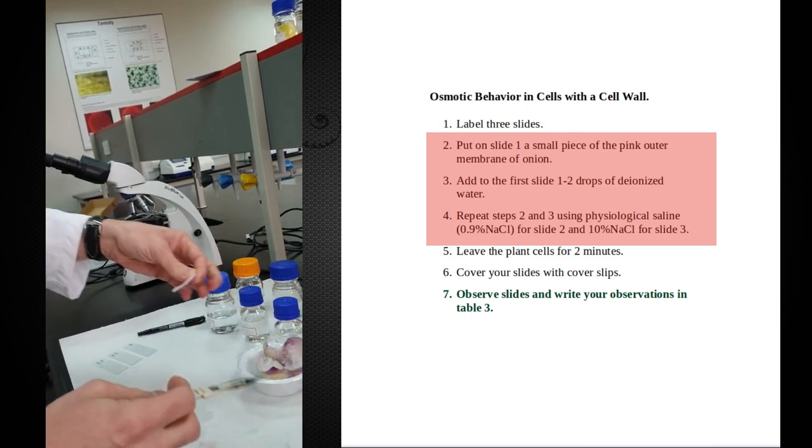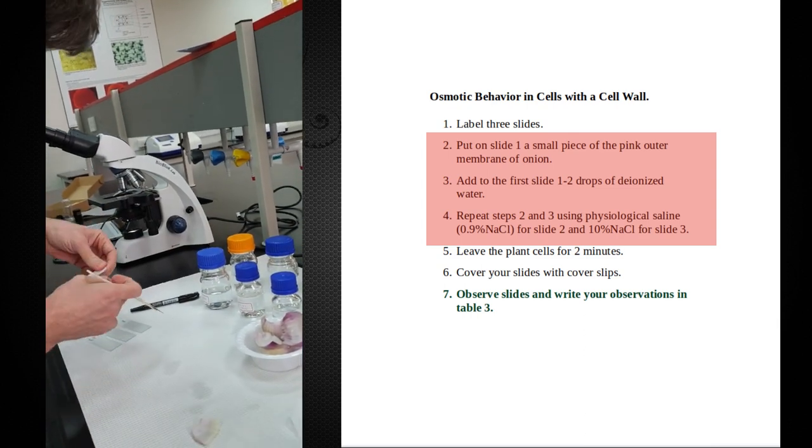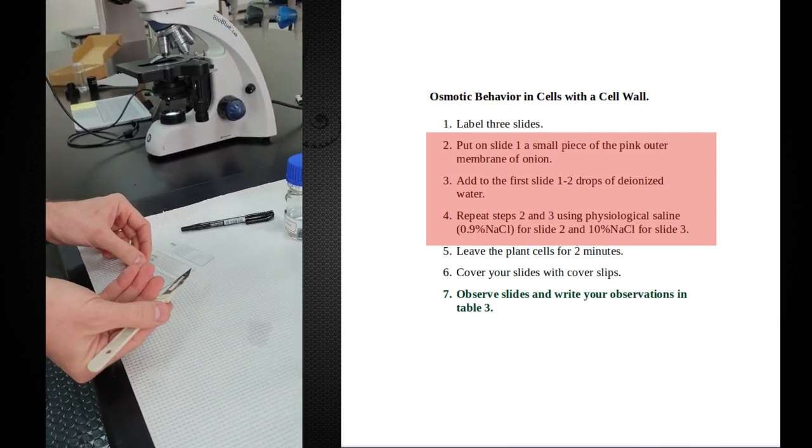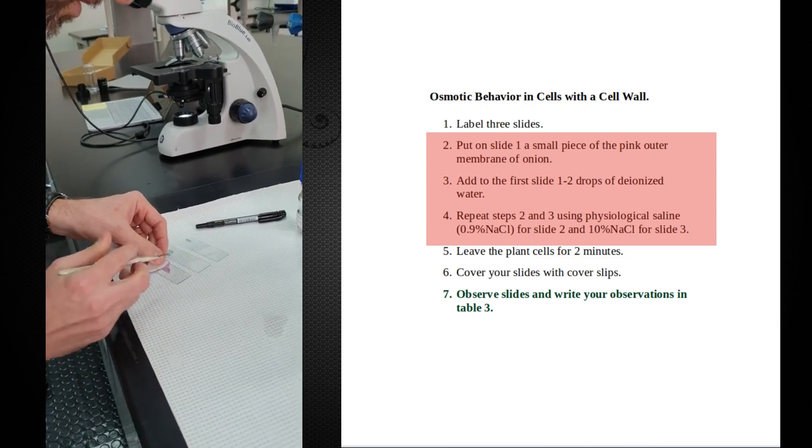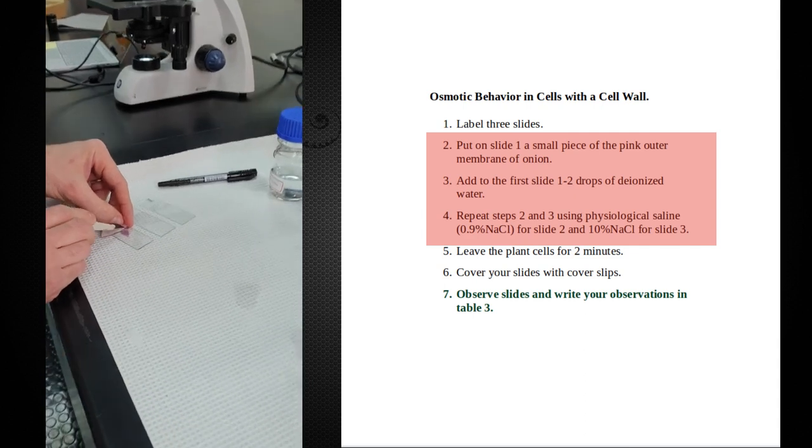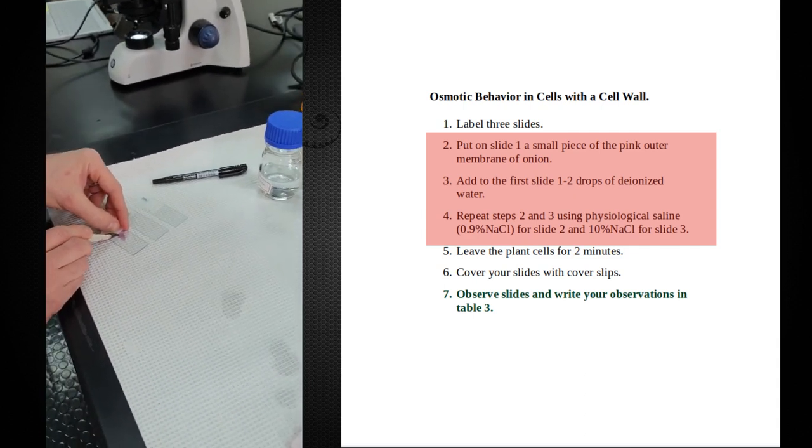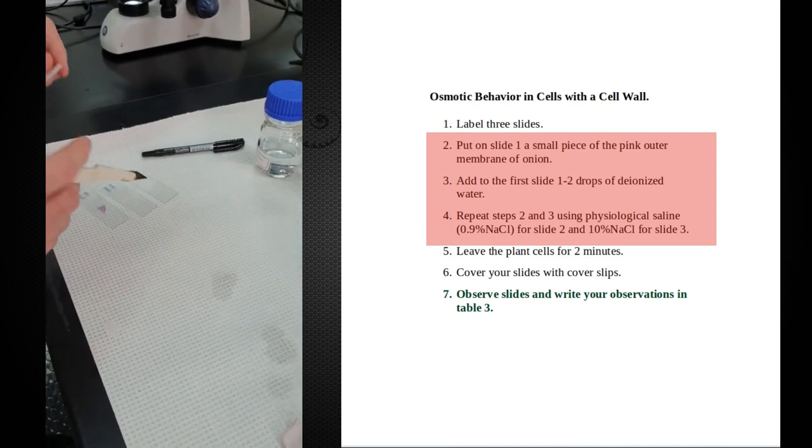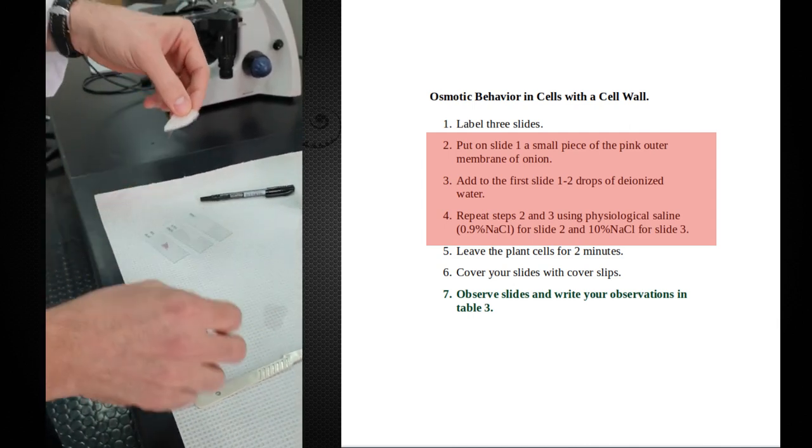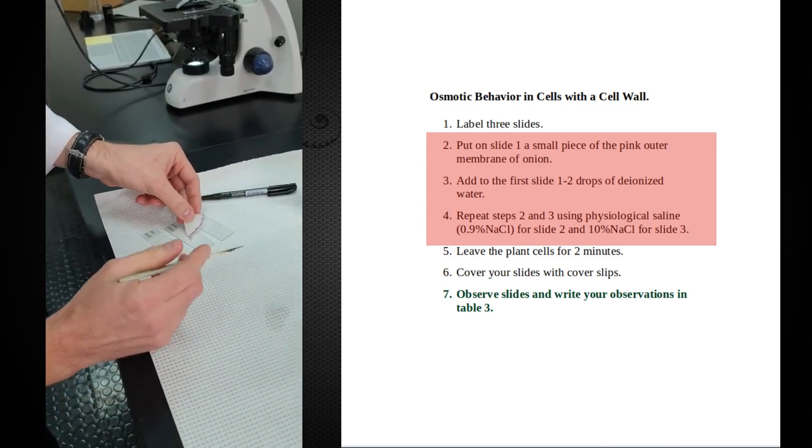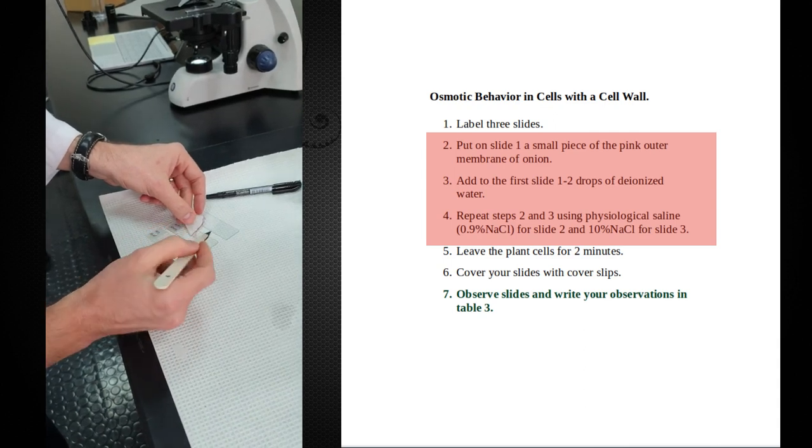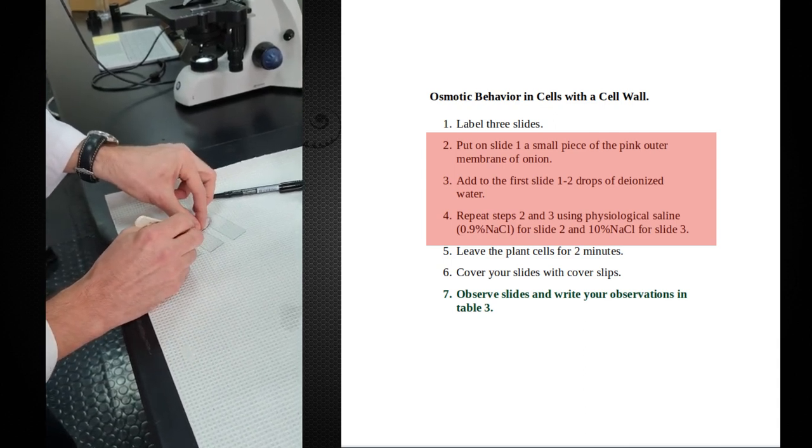Okay, so the scalpel, hopefully I don't cut myself with it. I'm going to take a piece and put it on here.